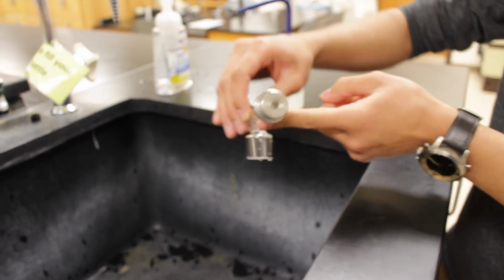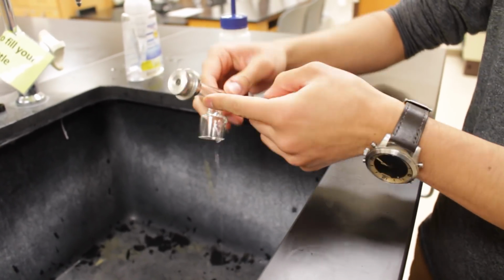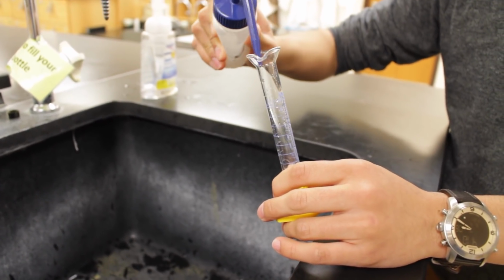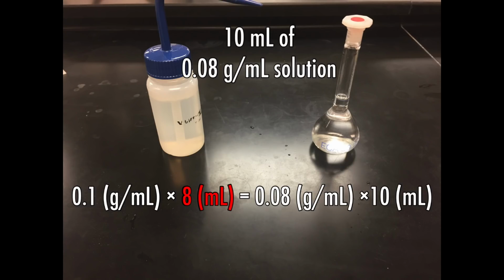After recording the number on the polarimeter, dump the solution and wash the cell with distilled water. Also, before making any other concentration solutions, wash the cylinder with distilled water as well. Now we are going to show the example of a 0.08 grams per milliliter solution. Do the same calculation to find how much of the original 0.1 gram per milliliter solution you need to add.